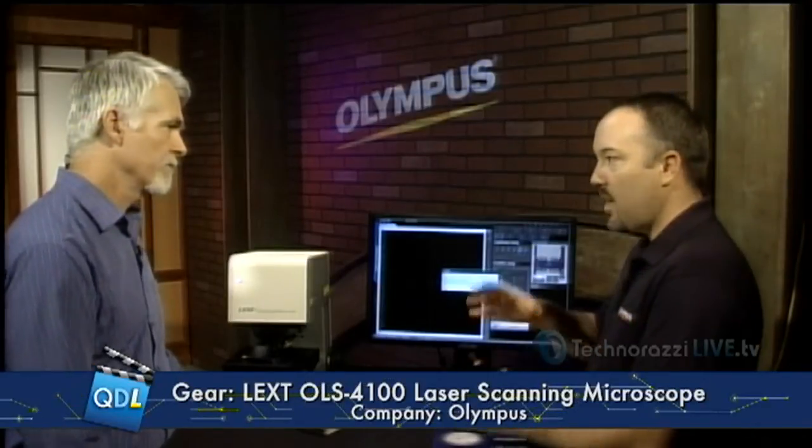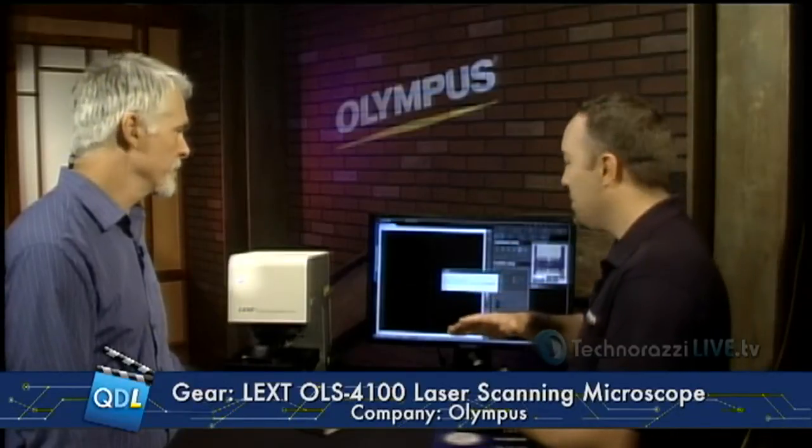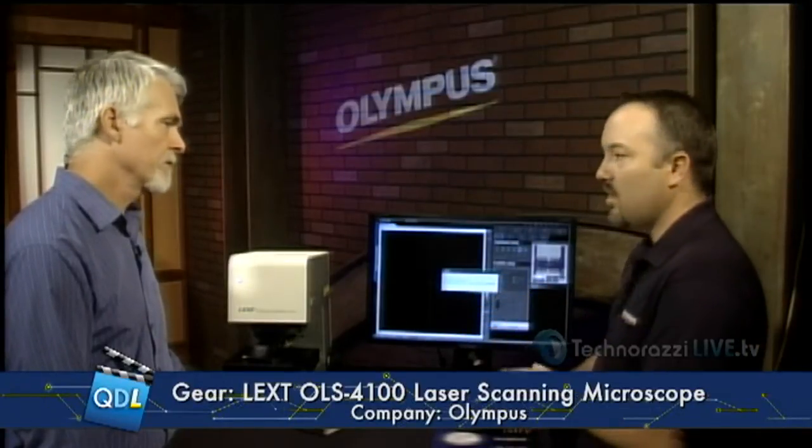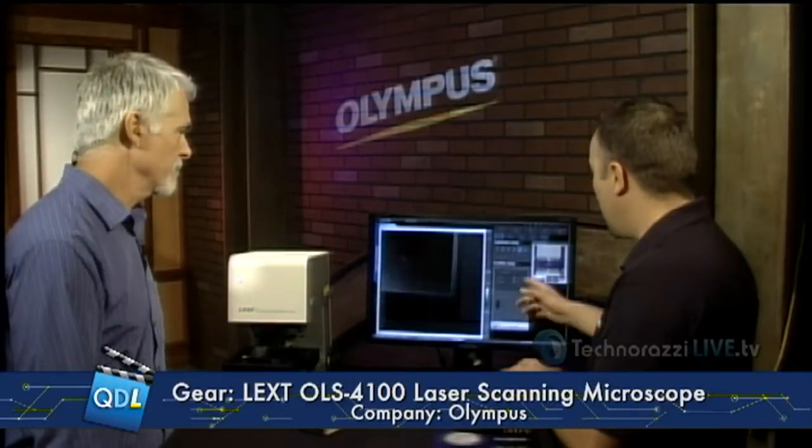This is kind of like a quick pre-scan just to see where... Correct, a real quick pre-scan to see the brightness levels and the points of focus, to determine where it needs to scan through to take the actual image. As soon as that completes, it'll go through and take its normal scan, capture all the high-resolution image, and then capture a color scan as well, since we selected capture color.